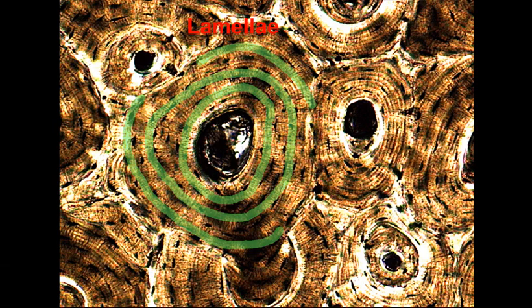Another thing you can notice is that these rings of osteocytes in lacunae are kind of stacked — there's one ring, a second ring, a third ring, a fourth ring. Each individual ring is referred to as a lamella.